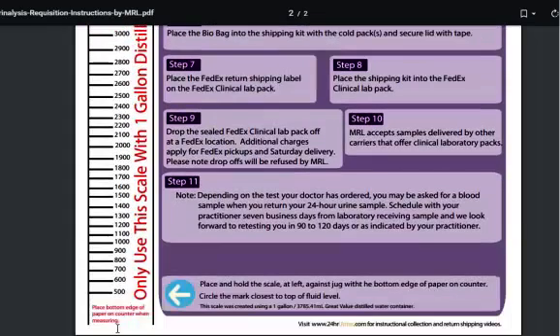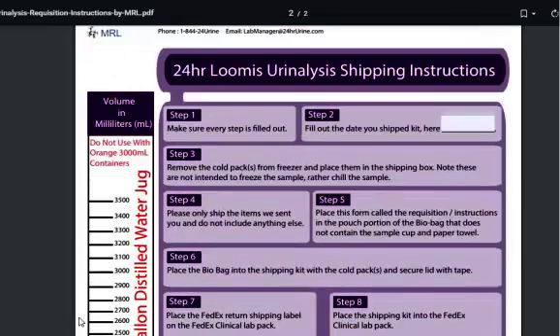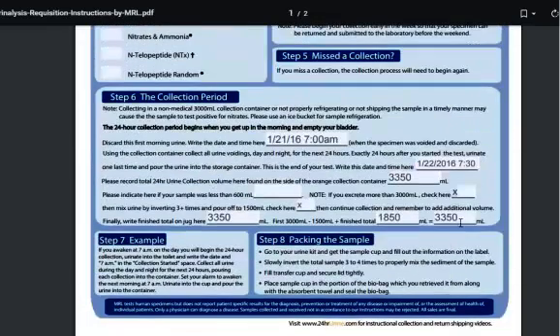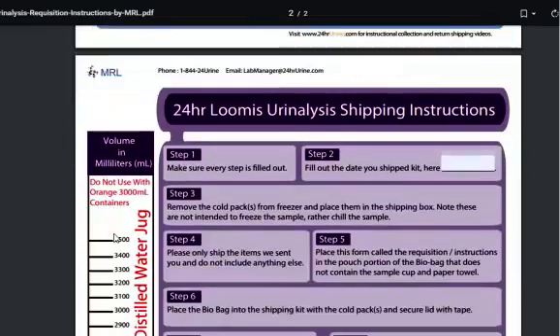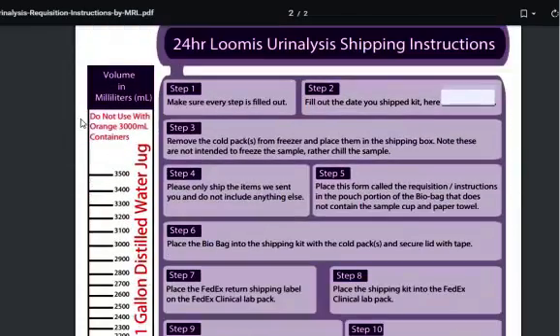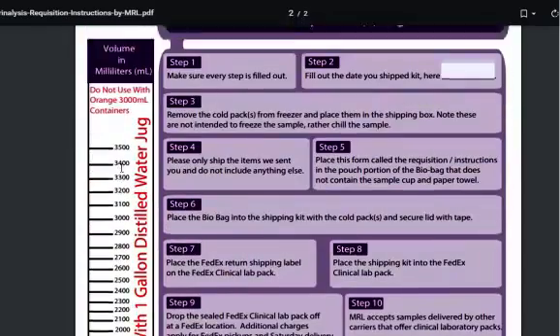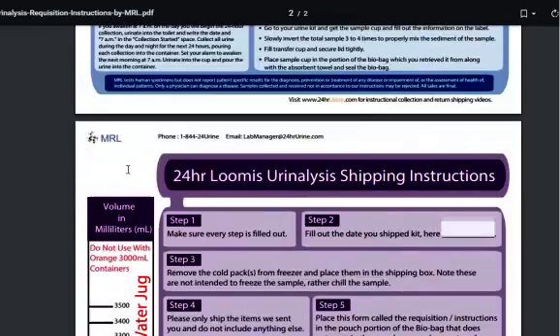So place the bottom edge of paper, the very bottom, not where the black stops, because that's a printing margin, up against our jug, and make a mark right here. Then write that number right here, not on the jug, but on the paper. If you have an orange container, that already has graduated marks on it, and plus, it's a way more professional way to do this.